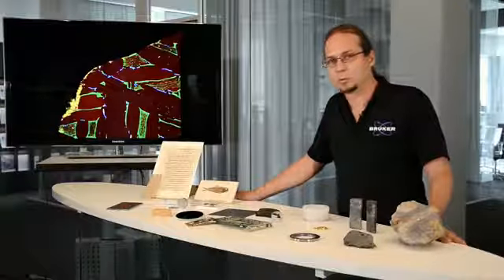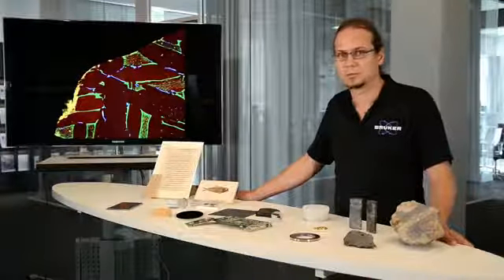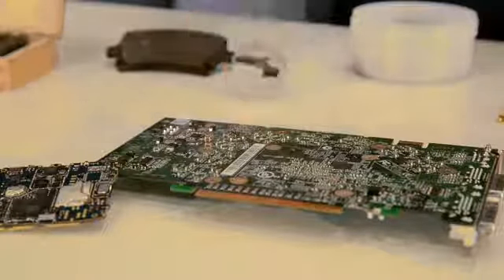This allows a unique opportunity to study not just bulk materials but also layer and coating thickness of different materials, like in this case the gold coating on the surface.